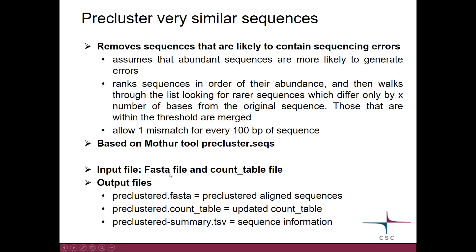As input we need to give a FASTA file and a COUNT file. As output we get a FASTA file with only the pre-clustered sequences, an updated COUNT table, and an updated summary file.